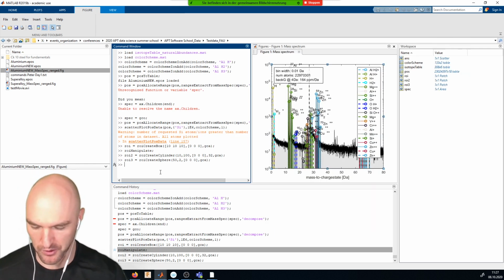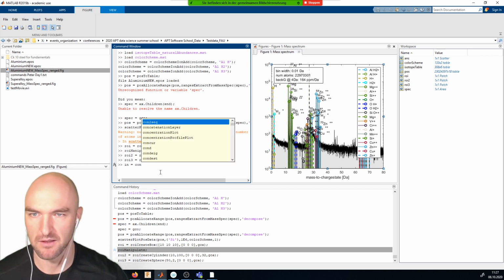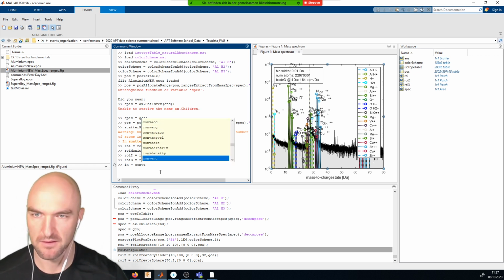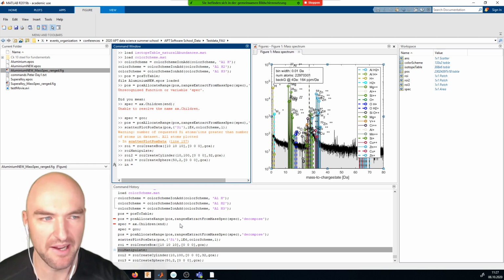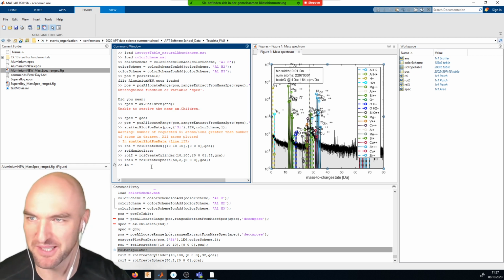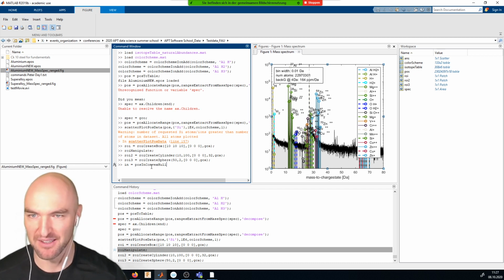So how do we do that? We can do that by just creating a logical variable. Now obviously this has been renamed. Can one of the tutors help me, what is the containment test called? Oh, thank you. pos in convex hull.